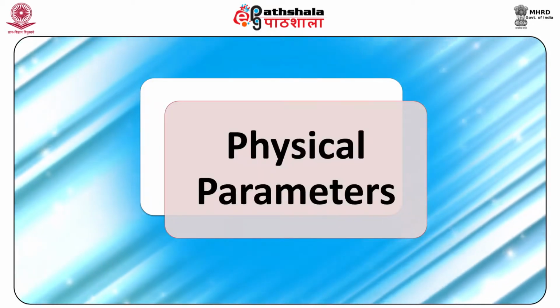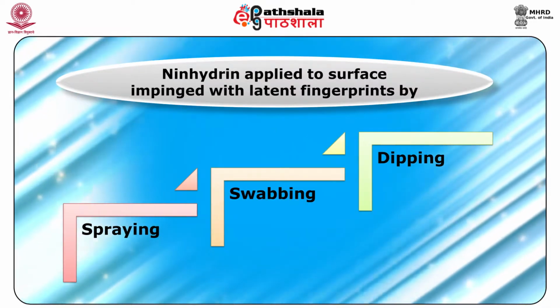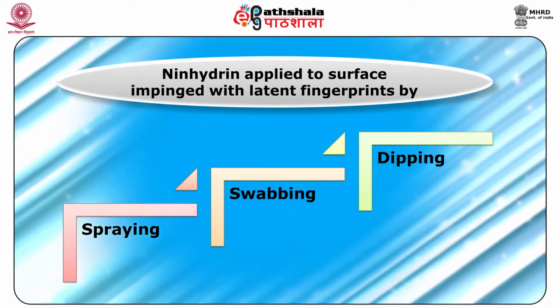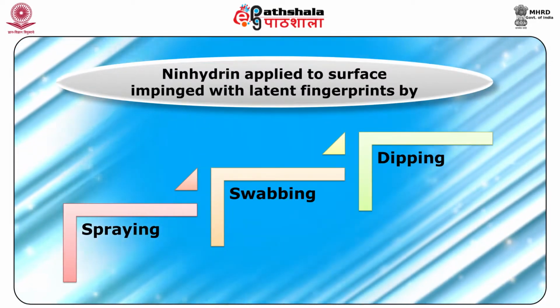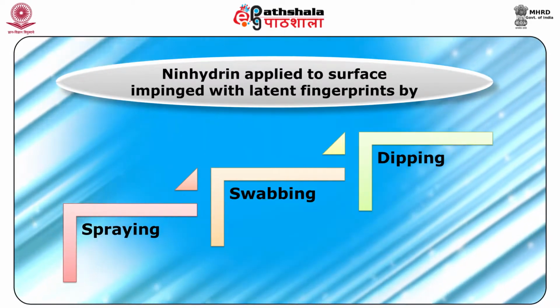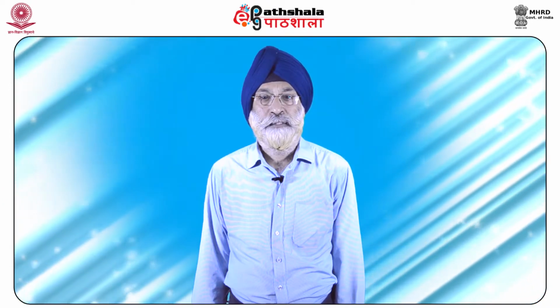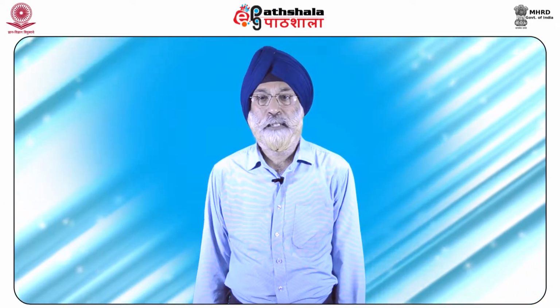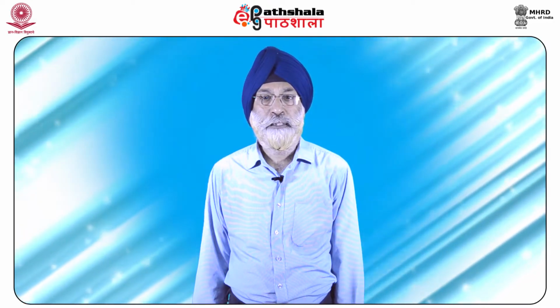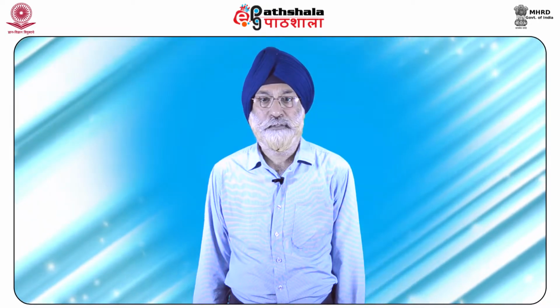We now take up the physical parameters. Ninhydrin is applied to the surface impinged with latent fingerprint generally by spraying, swabbing or dipping. Of these, the dipping procedure is most extensively used. However, fragile papers such as paper napkins tear apart on dipping, and therefore the spraying procedure seems to be better for this type of surface.